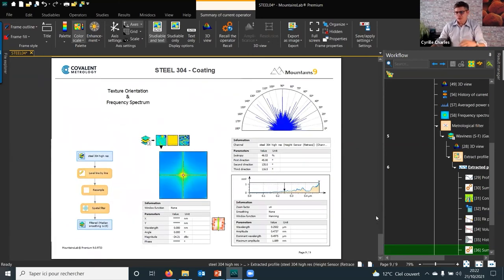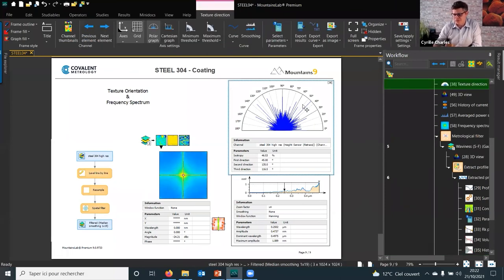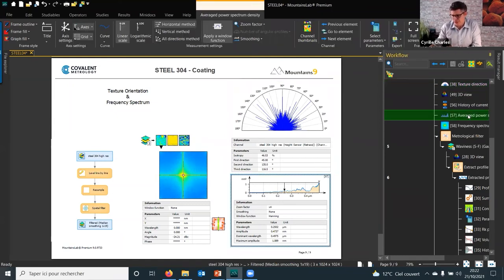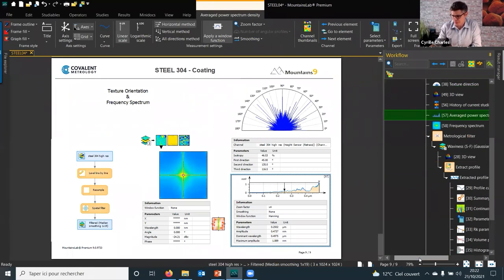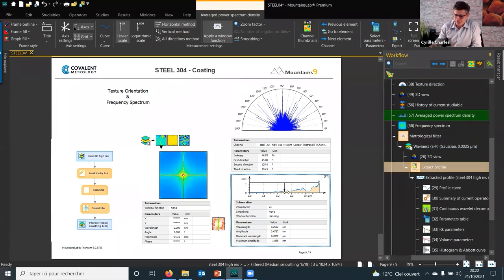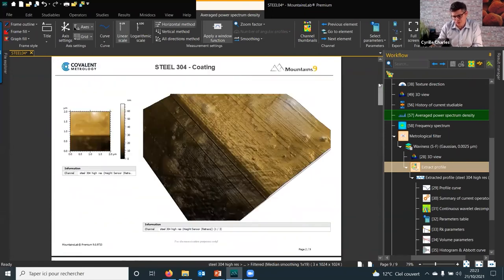On the next page I wanted to know if there is some directionality on the surface. This diagram is based on the FFT — it's a texture direction analysis. When I click here in the workflow and select the average image power spectrum density, the result shows there is no specific direction because the isotropy is above 30 percent.